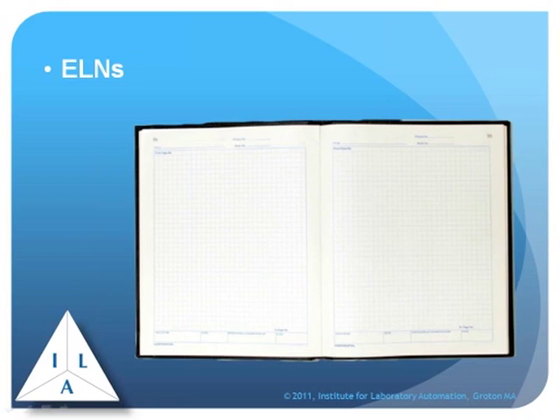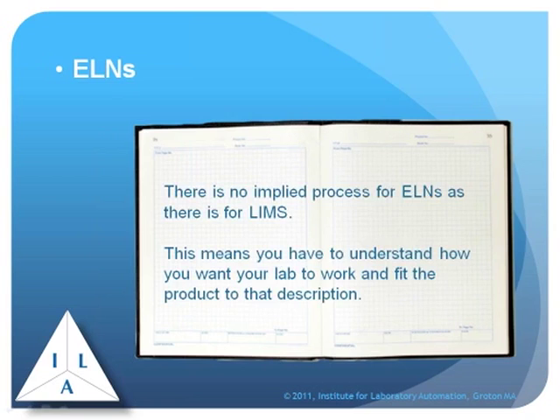And actually, in a very simple way, it can be used as an effective system. But unlike LIMS, there is no implied process for the use of an electronic laboratory notebook. You really have to understand how you want your laboratory to work and how this product is going to fit into that work.